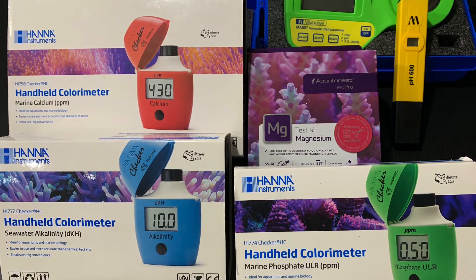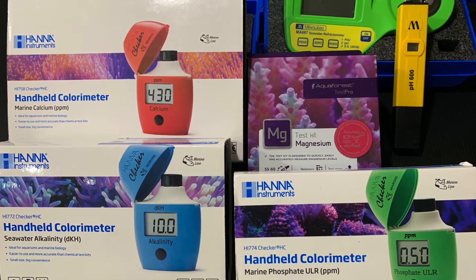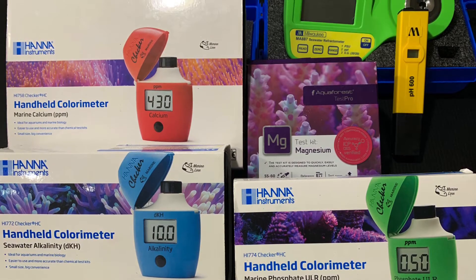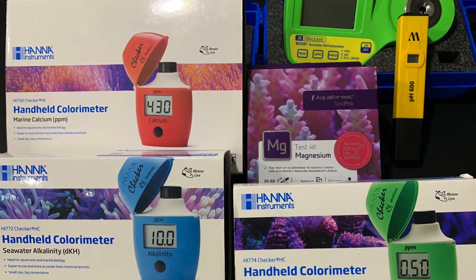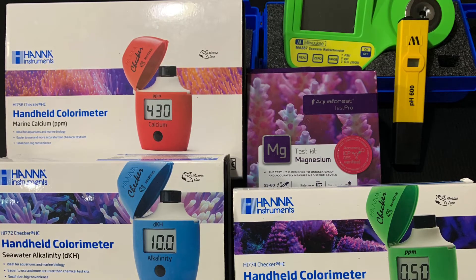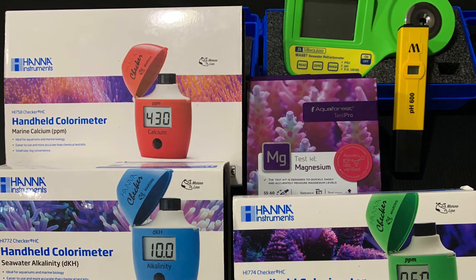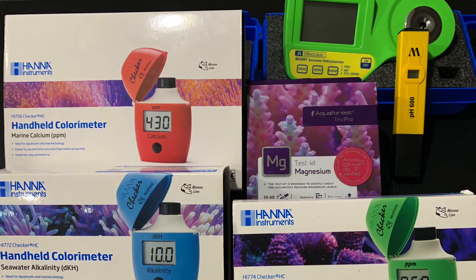Last but not least, what I use to test my pH is also from Milwaukee — the Milwaukee pH tester. It's that little yellow object you see to the right of the salinity tester. The only downside is that it needs to be kept lubricated — the black bottom cap is supposed to hold water, but once you put the tester in, the water seeps out and you have to keep refilling it. Otherwise it's pretty accurate at getting your pH number.